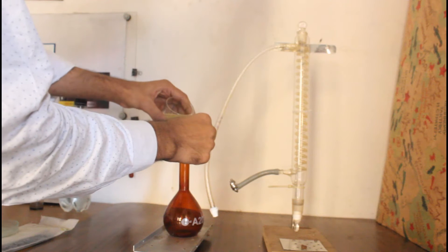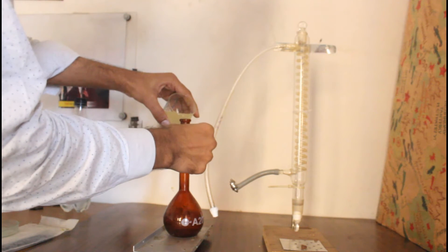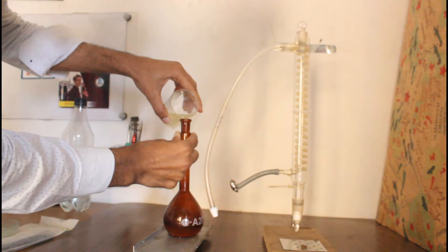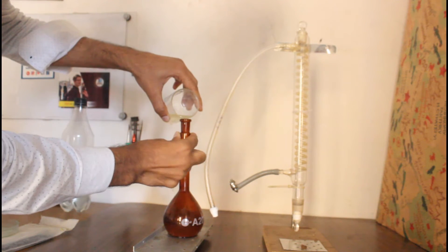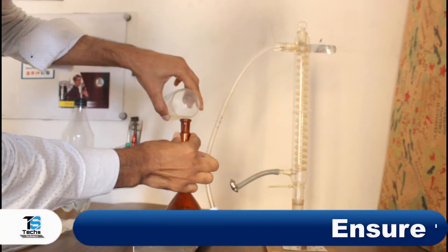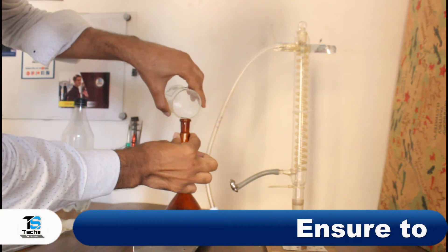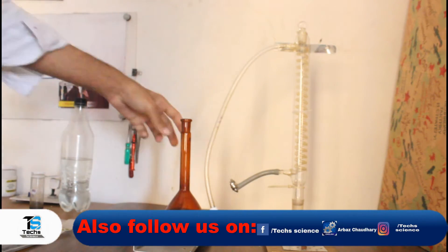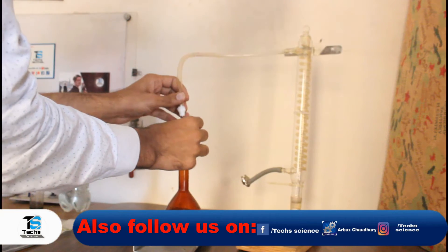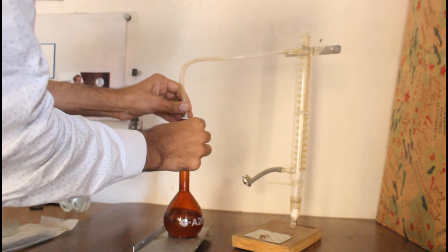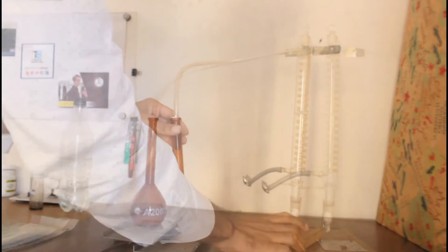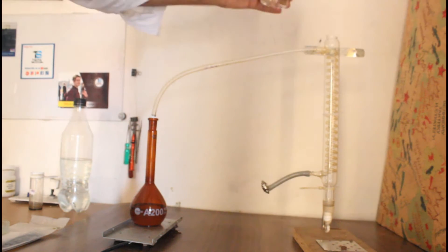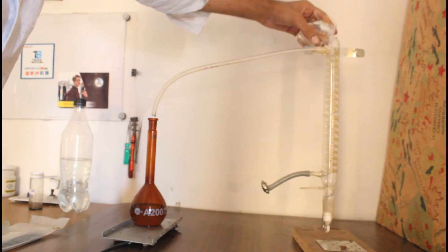Now I will set up for the distillation. I will put this solution into this vessel and then I will heat it using this hot plate. I already made a setup for the distillation. Okay, now I have to pour cold water for this distillation tube.